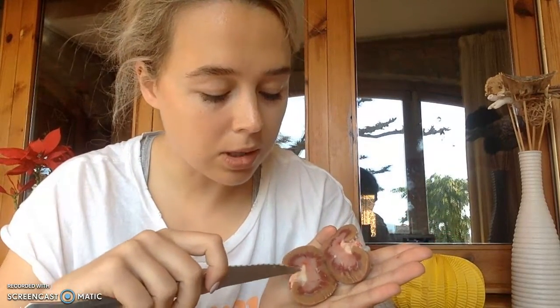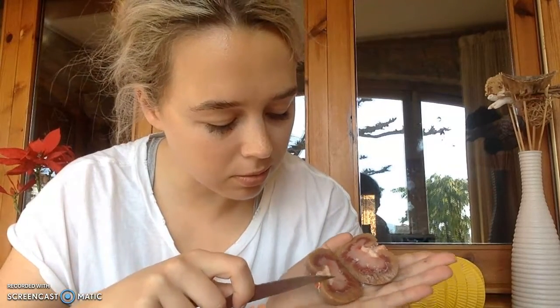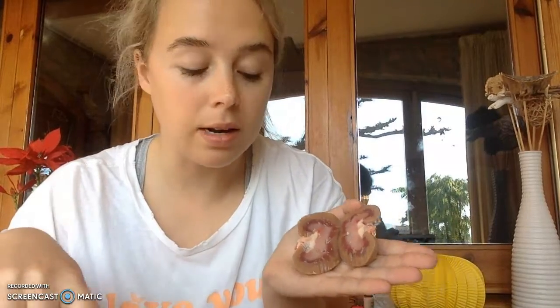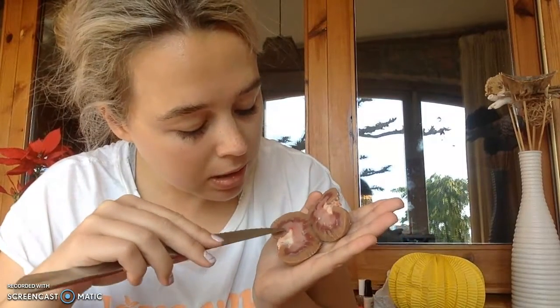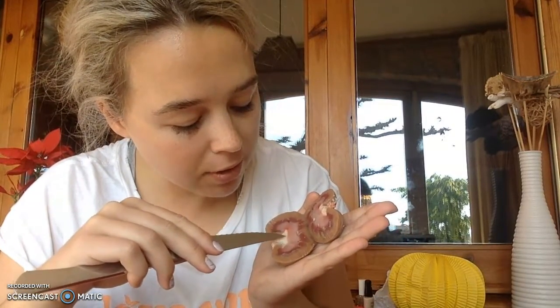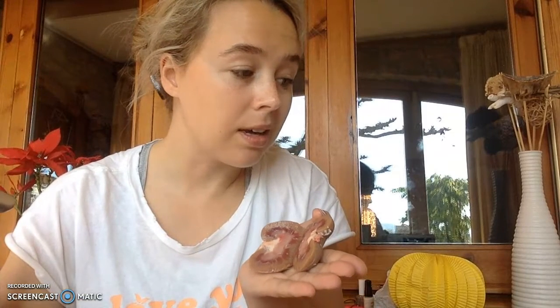Hilum is all this area right through here. It's a circular area right there. That would be the hilum of the kidney. This area right up here with the tip of my knife, that is the renal sinus. So you can kind of see it's the space where we don't have this fatty tissue or we don't have any cortex or medulla, and that is going to contain some important veins and arteries and lymphatic vessels and blood vessels. Did I miss anything?